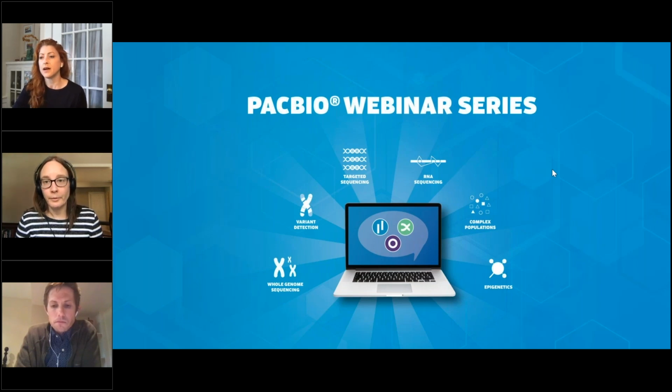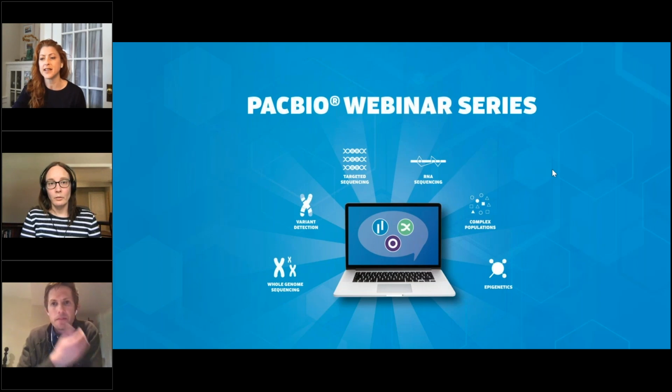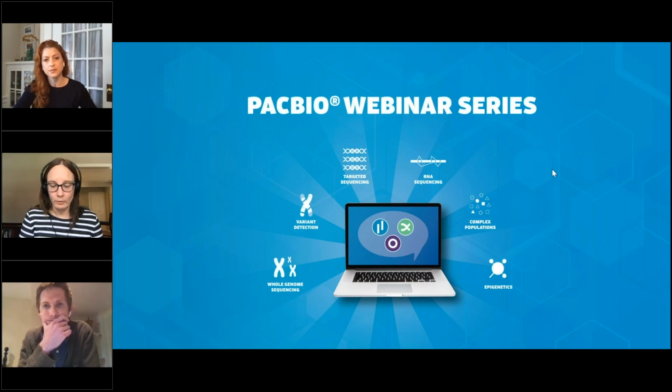Awesome. Let's see, can the iGenotyper work with long-read RNA-seq data like Iso-Seq?